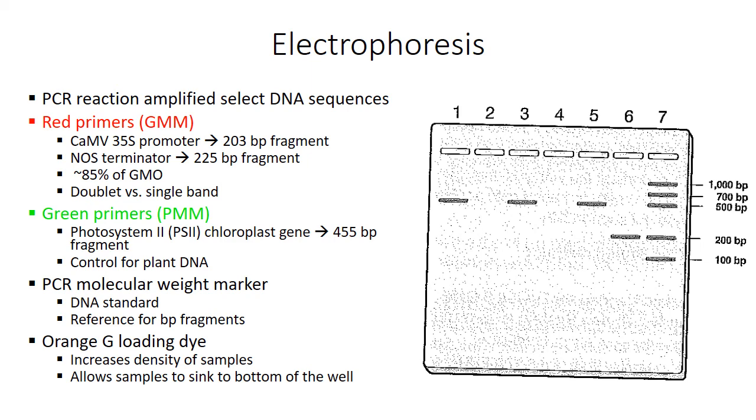You also have the use of your PCR molecular weight ruler that we can utilize to standardize our different sizes and their location, making it easier for us to identify our 200 and 400 base pairs.